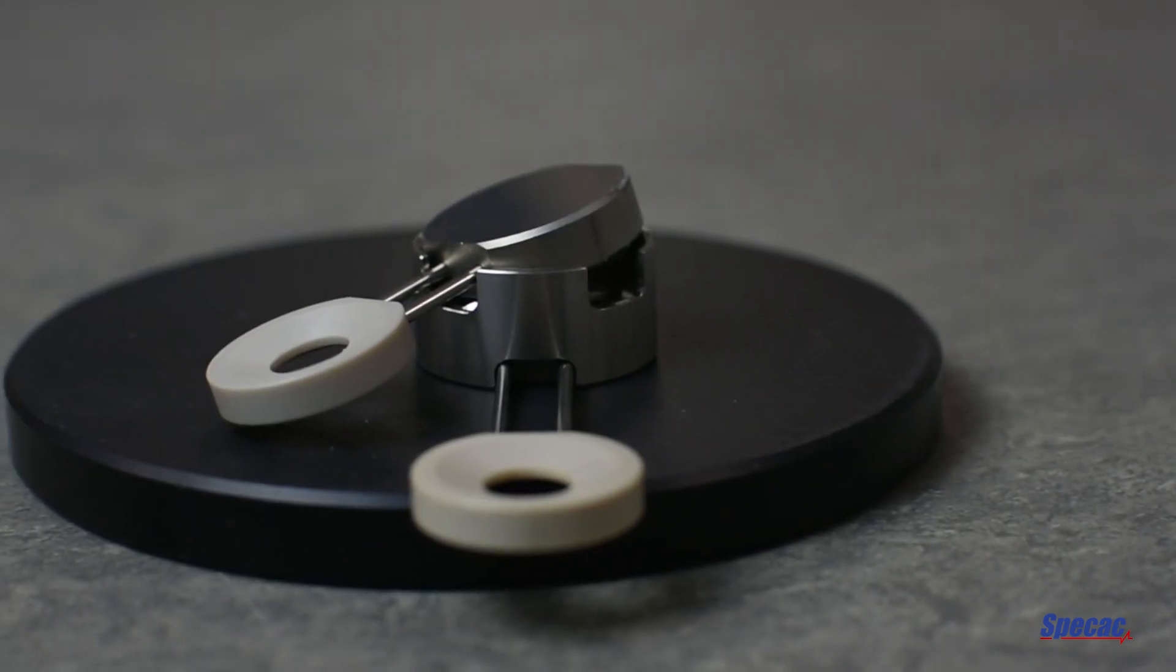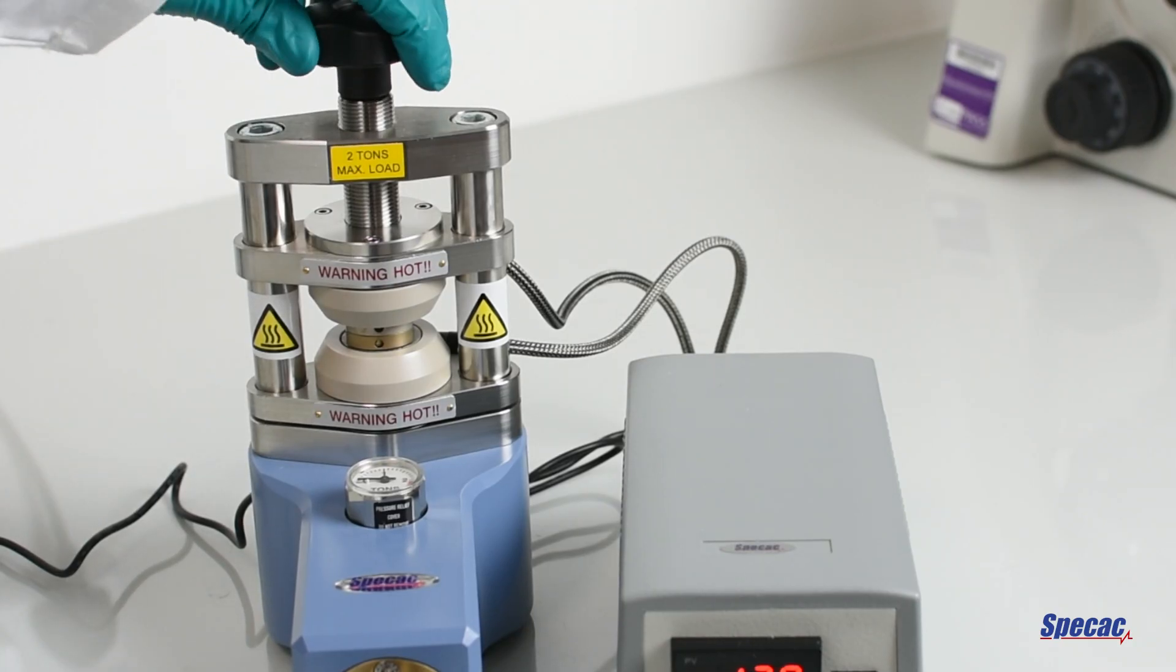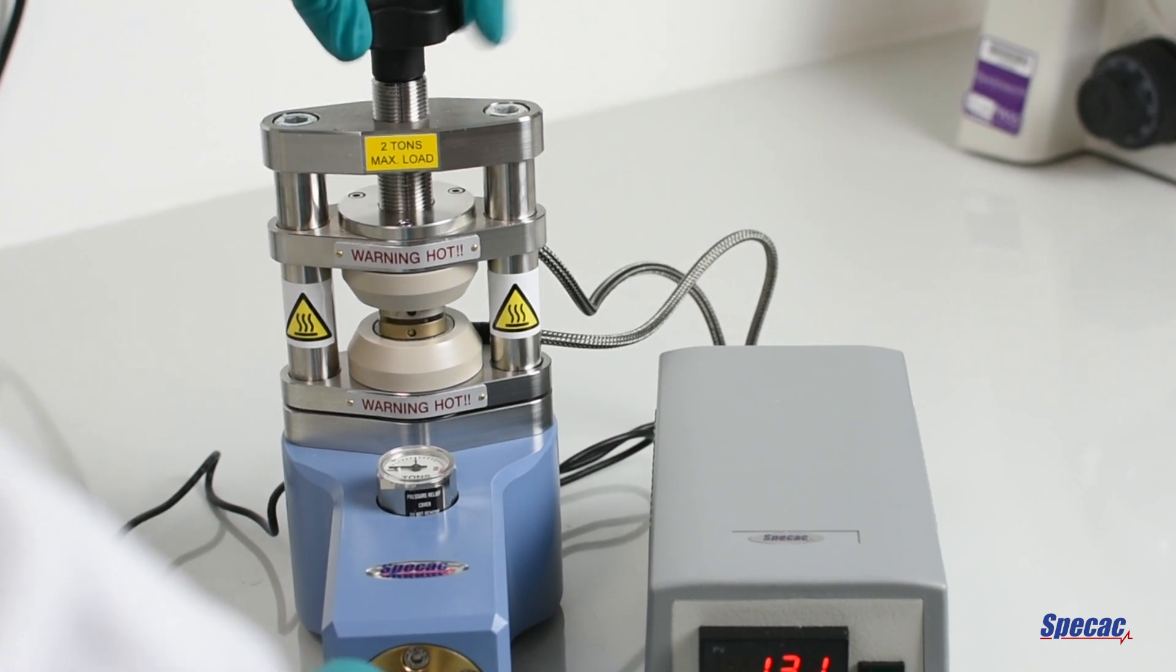Once the temperature of the press has stabilized, the prepared film maker assembly is ready to be placed into the press. To insert the constructed film maker assembly into the press, turn the lead screw knob anticlockwise to create a gap between the heated surfaces.